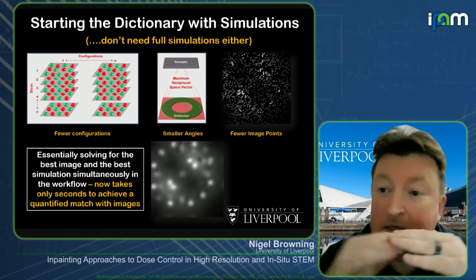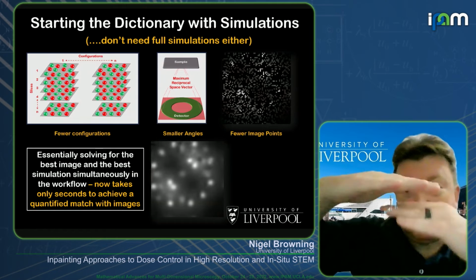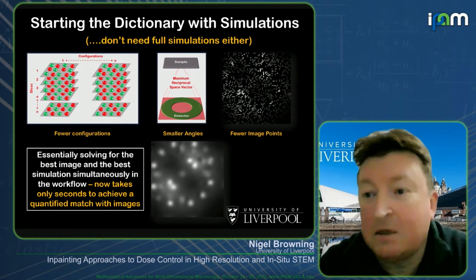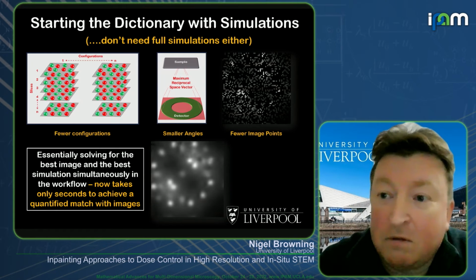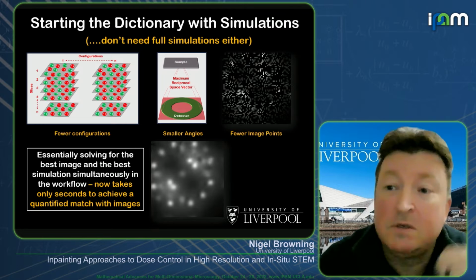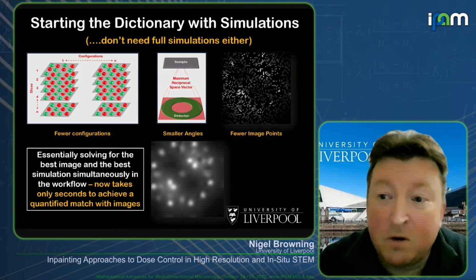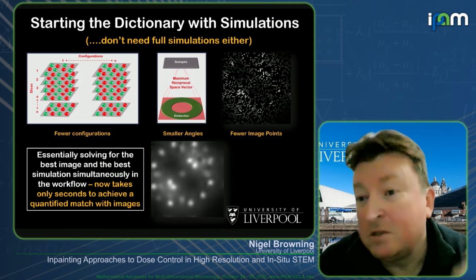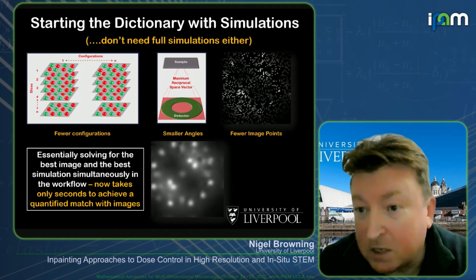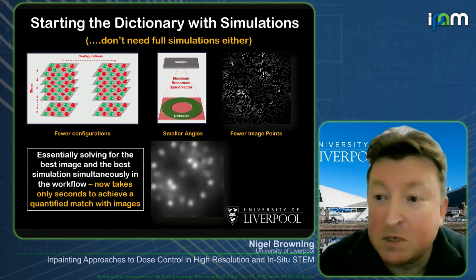So what that means is that the dictionary that's being developed will work for the simulation and the stack. So it's actually solving the set of them together. So rather than matching theory to experiment at the end of doing the experiment, it's actually using the theory to help seed the dictionary, which again, because you have a quantitative use of a dictionary to do your reconstruction, your best fit, you're able to then match the dictionary or match your simulation to your experiment at the same time.